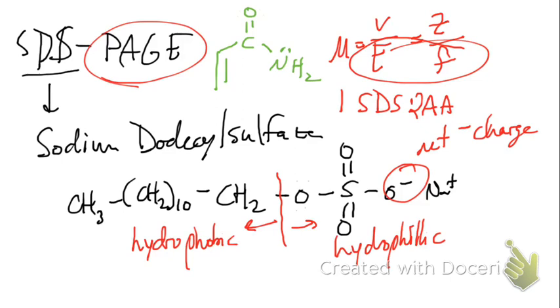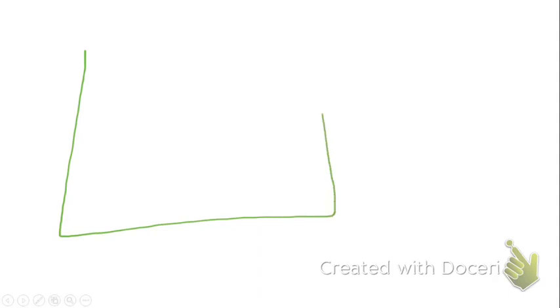When it becomes polyacrylamide, when it becomes a gel, it's very non-toxic. Just to let you guys know, if you like French fries or you heat carbohydrates at a high temperature, you do get some acrylamide. Not enough to be worried though.